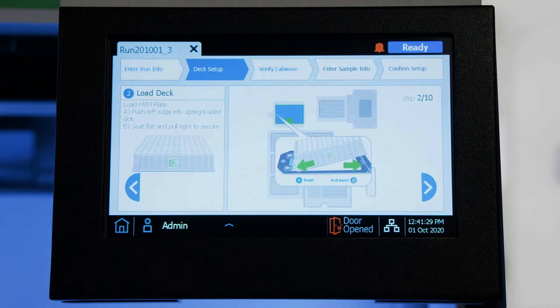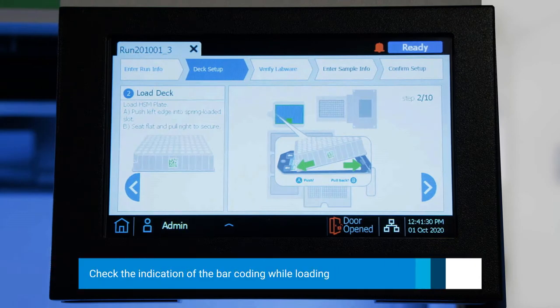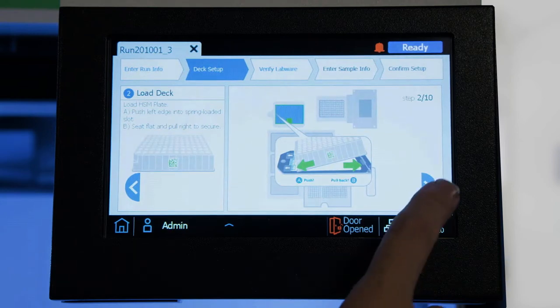One thing that is nice about the touch screen is that it indicates the direction of the barcode as you are loading it, as well as the placement on the deck. We will click Next.